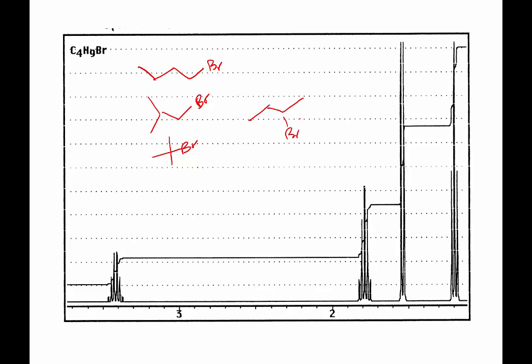So the question is, can we match each spectrum to the right molecule? And there's a lot of ways to do this.